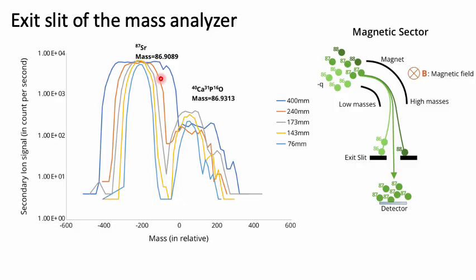Is the tuning process getting harder when you decrease the slit size? If you decrease the slit size too much, then the mass peak becomes too pointy, and any slight variations in the voltage of the detector are going to measure off the peak. And then you get really imprecise. You're still measuring something, but it's going to be very imprecise. So you want a broad enough peak, but not so broad that you have overlaps.